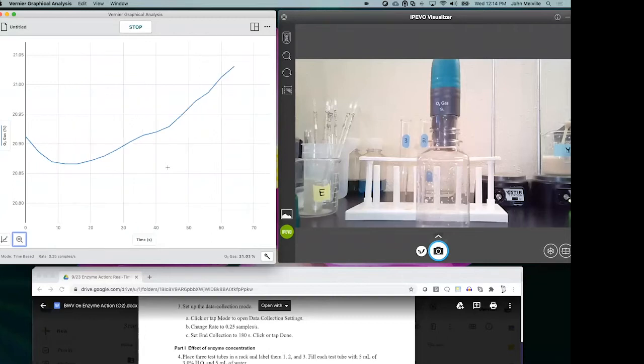is, for those of us biologists, we almost always do our negative control first. It can be really helpful to actually use that zoom in button first so that students see a response happening right away.